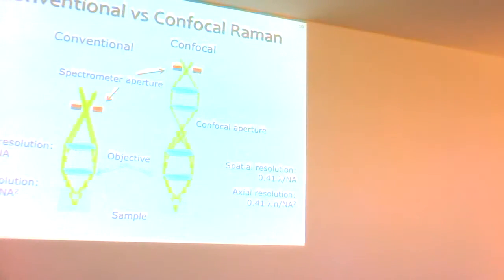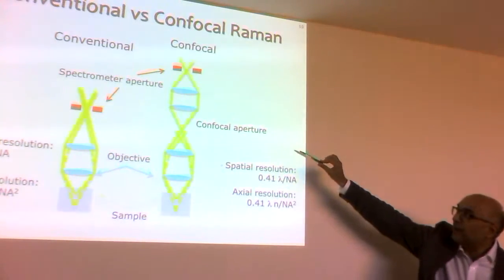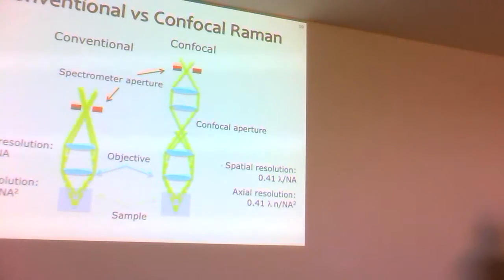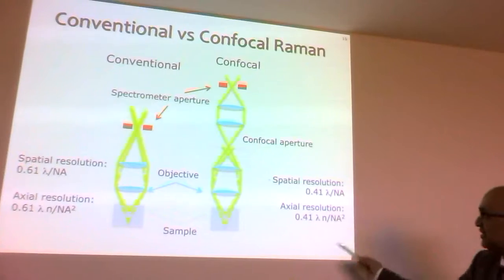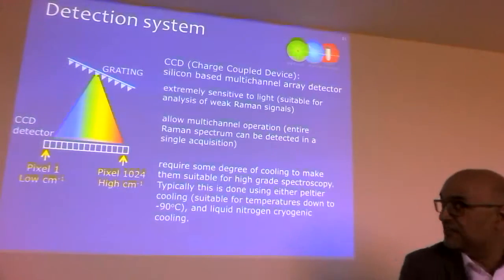The optics is essentially the same as a microscope. The only difference is you'll need a spectrometer, because we're going to have to collect a signal that's spectrally dispersed from the excitation beam. And so here's an example of what we might do. You can have confocal Raman, or you can have an aperture. And instead of going to a CCD camera or point detector, I need to collect a spectrum. I need to collect all those lights, my chemical fingerprint, coming on. And that's the kind of geometry that one might use. And these numbers were already shown by Colin, I think. So there's nothing new in the optics there, or the imaging side, that you need to concern yourself with.